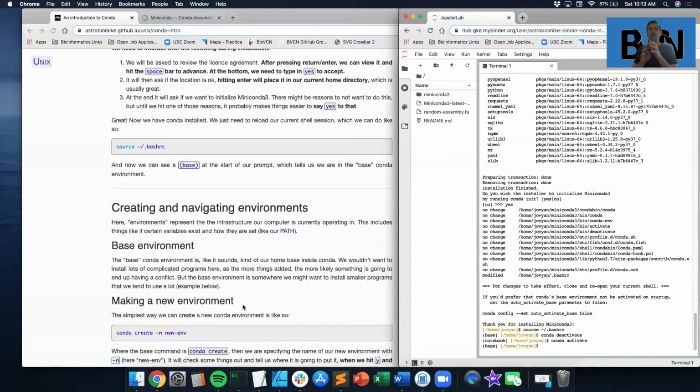So the idea is that you want to think about Conda as the overall arching structure that you're installing tools into. You only want the basic ones available in base, and then for either each pipeline or particular tool set, you want your own Conda environment for those particular tools, right? So we'll talk about a couple of them, but you want to set up this scenario where, when I run this particular tool, I move to this Conda environment, I run the tool, I leave that Conda environment, and then do something else.